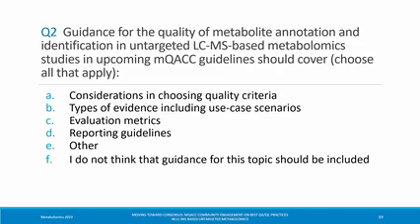Awesome, thank you. All right, I saw a hand on a microphone. Jennifer. Yes, so we have two ways with LCMS. The first is very similar, using stepped collision energies. The second is that we often move standards that we've developed for targeted pathways into our untargeted. That's really nice because we've often spent quite a lot of time optimizing both the collision energies and which our reporter ions should be. It's early in the morning.